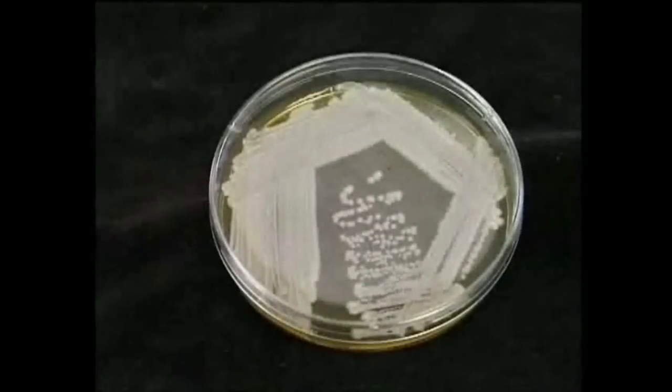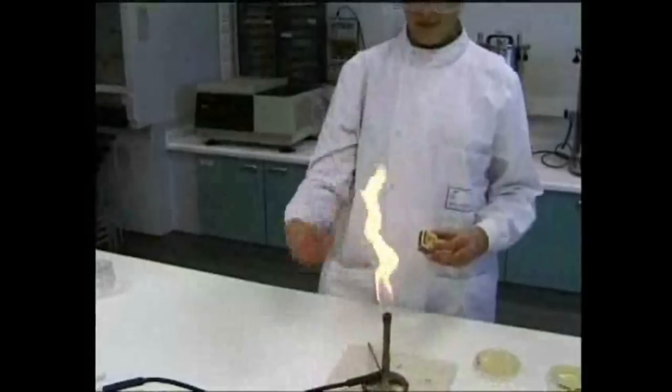Streak plates are used to isolate bacterial colonies or yeast. One well-isolated colony usually grows from one bacterial cell deposited on the agar. It can be assumed that all cells in the colony are the same and the colony is pure. The isolated colonies can be used to inoculate fresh sterile agar plates on which pure cultures will grow. The properties of organisms in pure cultures can then be studied.